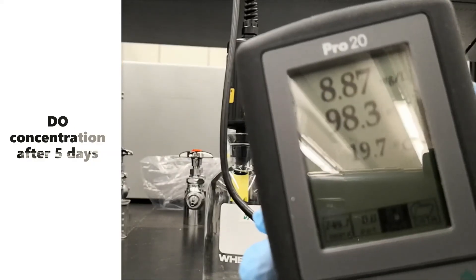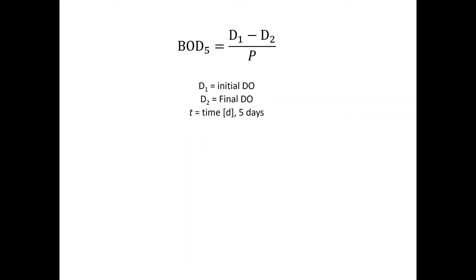And here is our results. Then how we can calculate 5-day BOD from our results. We need to have dissolved oxygen concentration before and after 5 days. And if you dilute the samples with dilution solution, you will need to divide DO concentration changes by dilution factor P. You can calculate P based on your dilution factor.